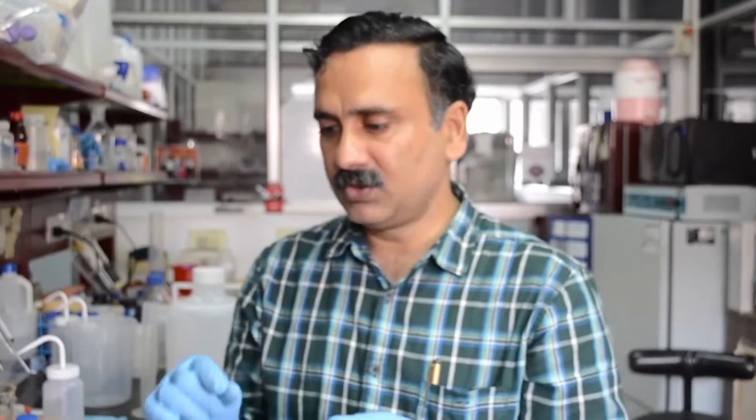Now we are going to continue with this electroelution, or this electrophoresis, for at least another 1 or 2 hours, and then we are going to see whether there has been electroelution or not. After that, we are going to remove the rubber bands and open the dialysis membrane from one end.